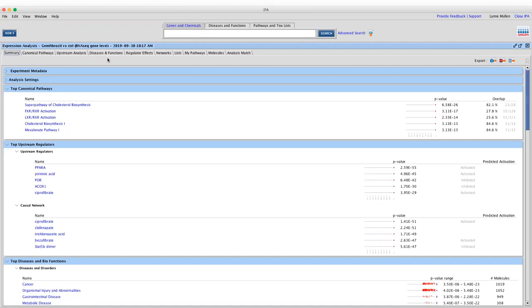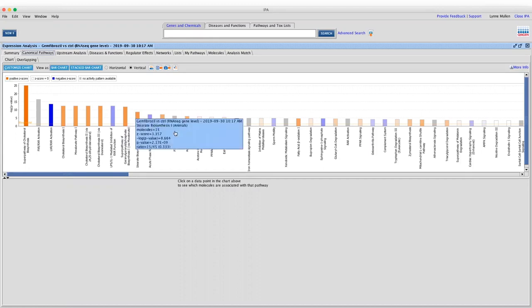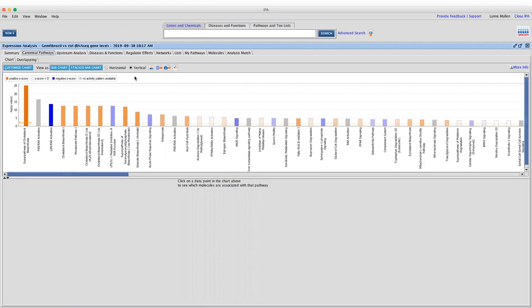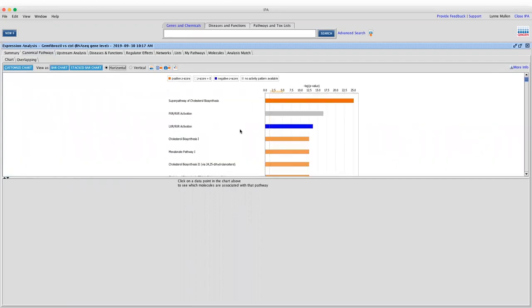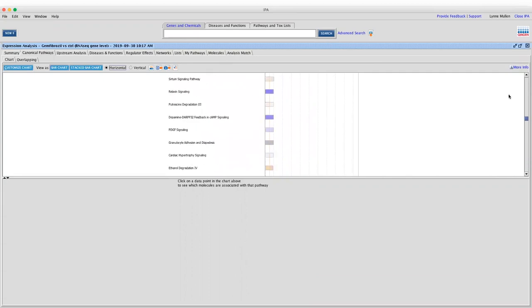Now I'll move on to the canonical pathways information to answer which canonical pathways are enriched in these gemfibrozil-treated rats. We have a bar chart showing enriched pathways. I prefer the horizontal view so I've switched it — that makes the pathway names much easier to read. We graph against the negative log of the p-value, so the taller the bar, the more significant the p-value. Pathways are arranged with the most significant p-values at the top, and everything shown has passed the 0.05 cutoff, represented by the orange line at negative log 1.3.